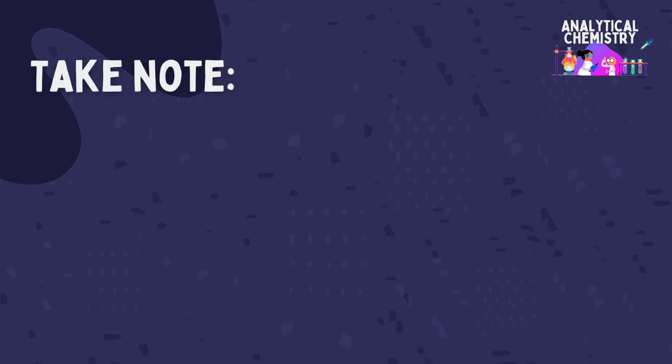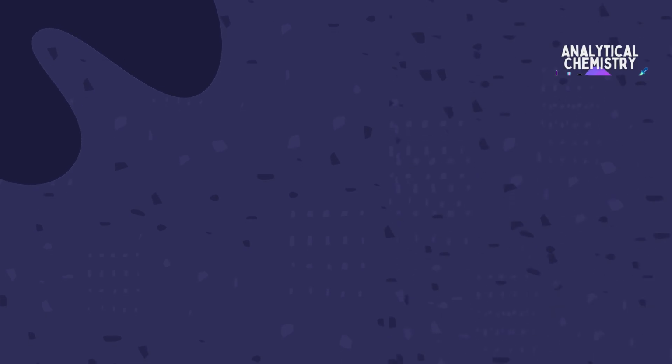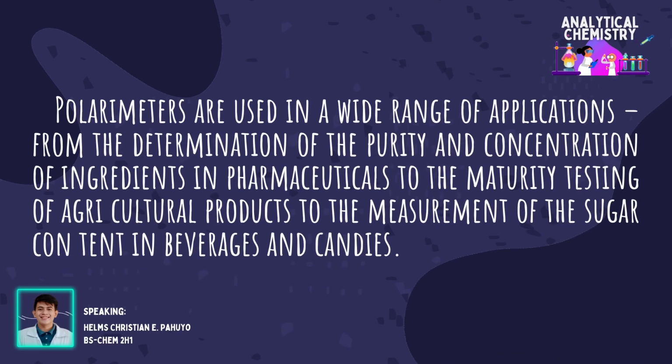The angle of rotation allows you to ascertain the identity and quality of substances as well as their concentration in mixtures. It can also indicate the progress of reactions and conversions. Polarimeters are used in a wide range of applications, from the determination of the purity and concentration of ingredients in pharmaceuticals to the maturity testing of agricultural products like measurement of the sugar content in beverages and candies.